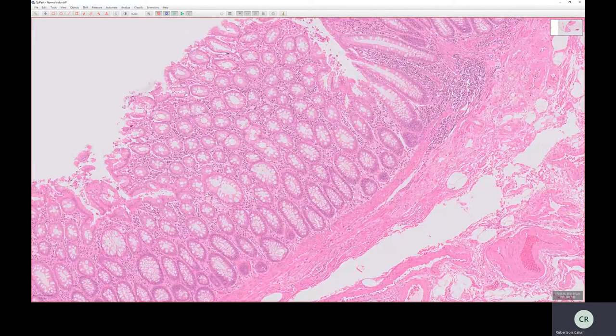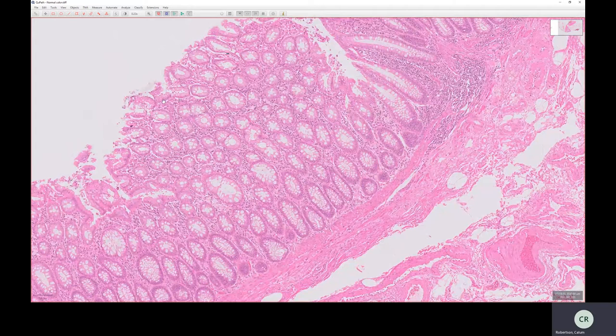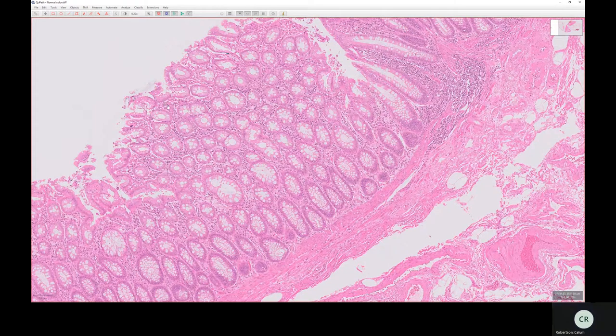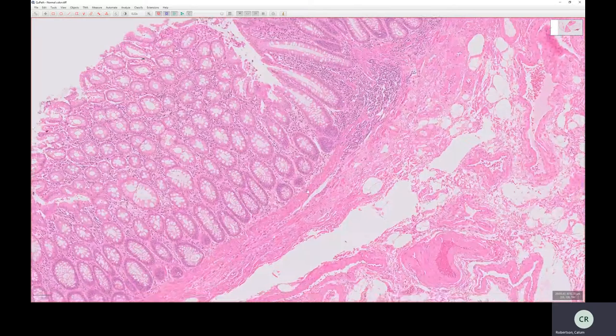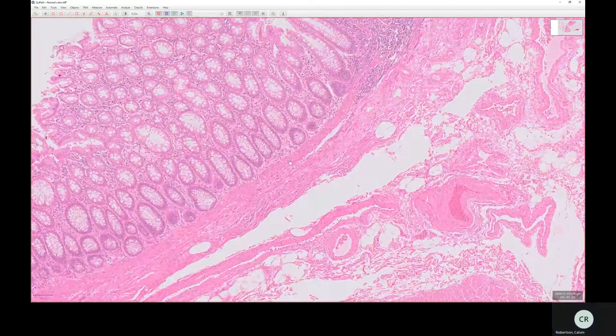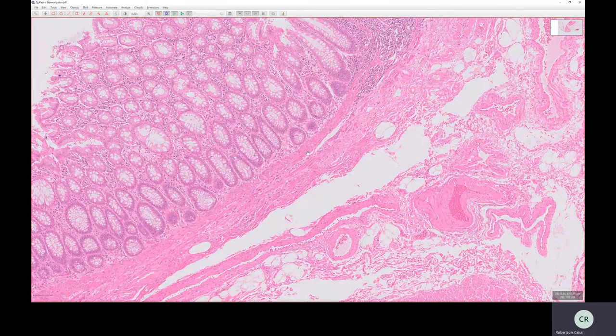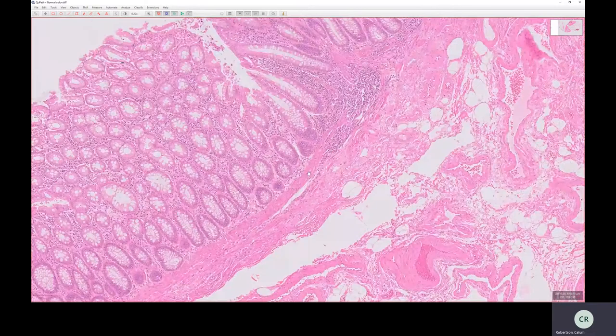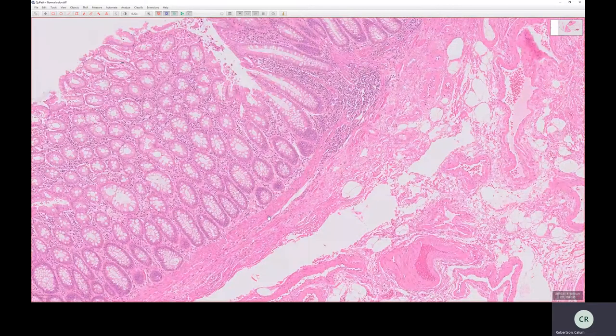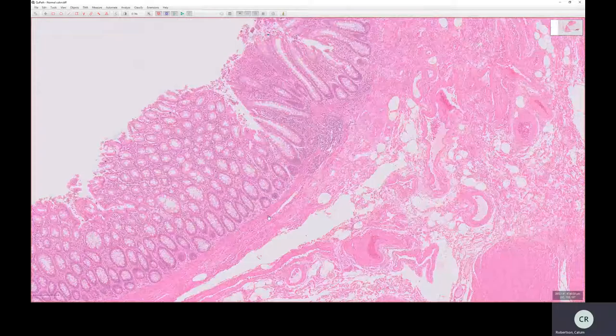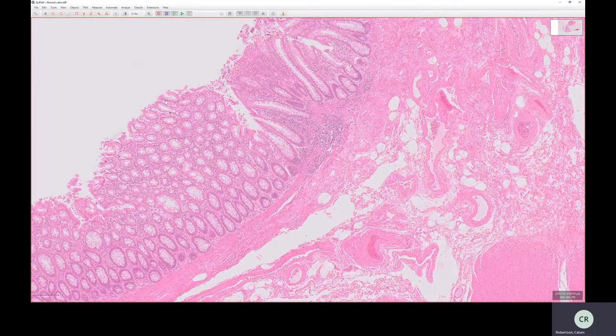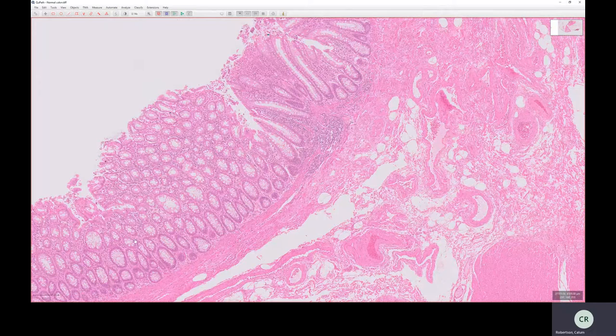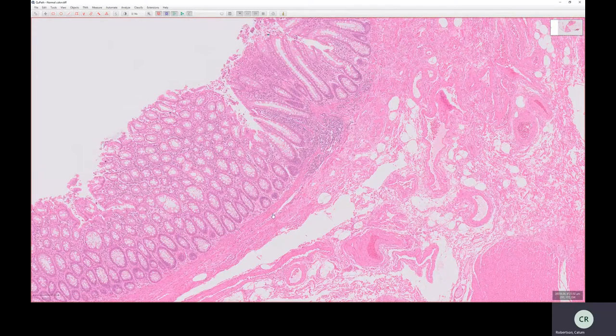So we've got the surface epithelium. Underneath that, underlying that, and in between that, we've got the lamina propria. And underlying both of these, we've got a very thin layer of bright pink cells, which are actually smooth muscle cells. And this is the muscularis mucosa. So the muscularis mucosa, the lamina propria, and the epithelium make up the mucosa. So from here, down to here, that's mucosa.